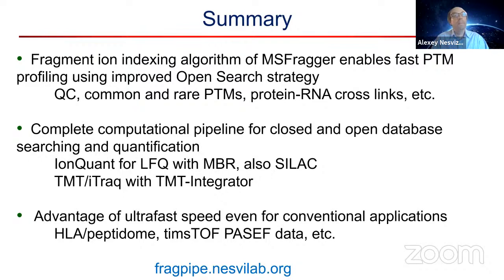With FragPipe you can generate the reports, but it's not something that's integrated. Those tables from the whole proteome analysis, your peptide or protein level quantification, and your site level or phosphoprotein level quantification from your phospho data, those two tables still need to be merged and normalized as a post-processing step. It's not integrated. It probably would be too hard to integrate into any computational workflow. It really depends on how you want to do this analysis, and that depends on the biological question that you have.